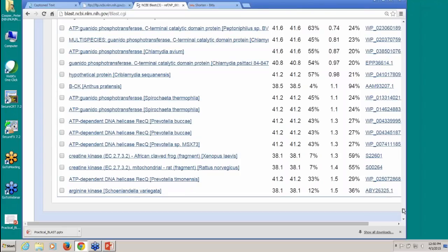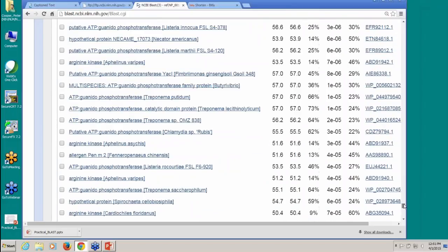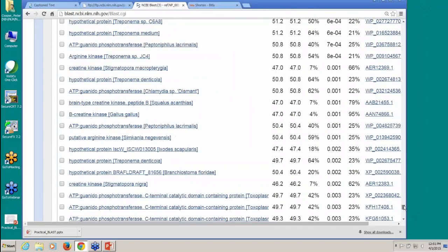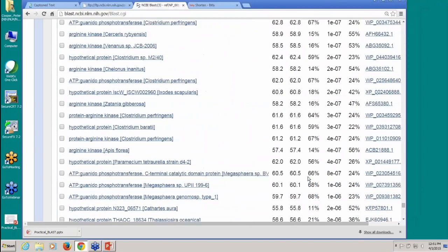But what can I tell about these hits? Nothing. If I have an e-value of 1, it means I cannot distinguish my results from chance. Where that exact cutoff is, where you decide that something's not due to chance, is a matter of taste and a matter of how you would feel about being wrong. So that's why there isn't a strict cutoff here. And we can take a look at one of these alignments if we want to.